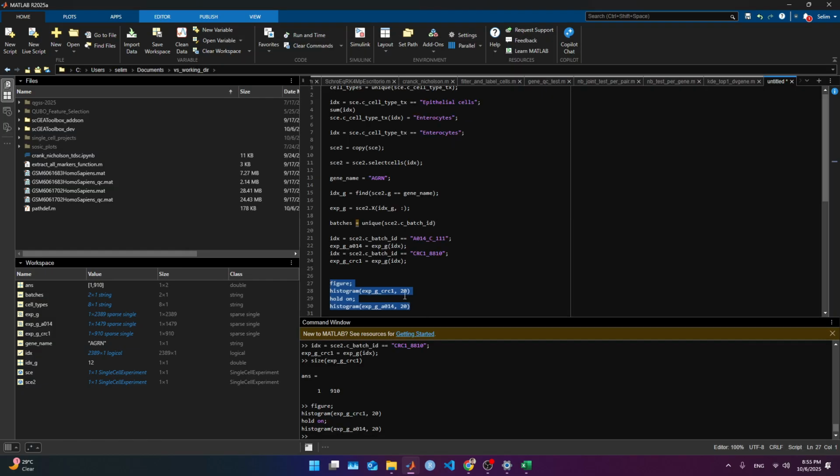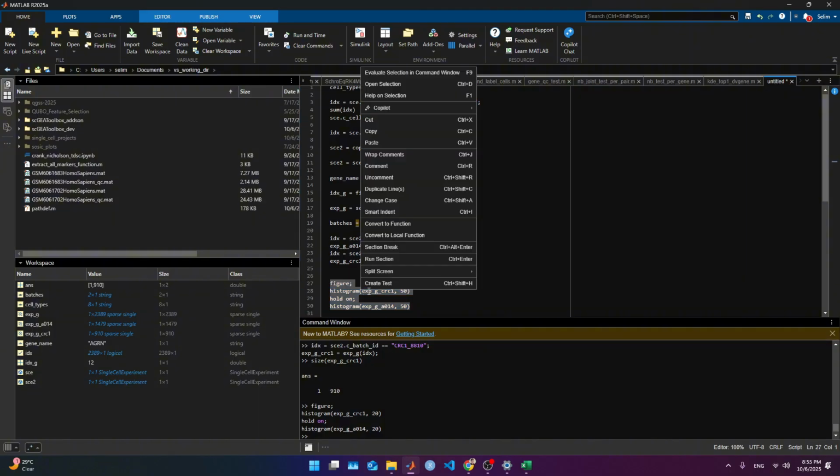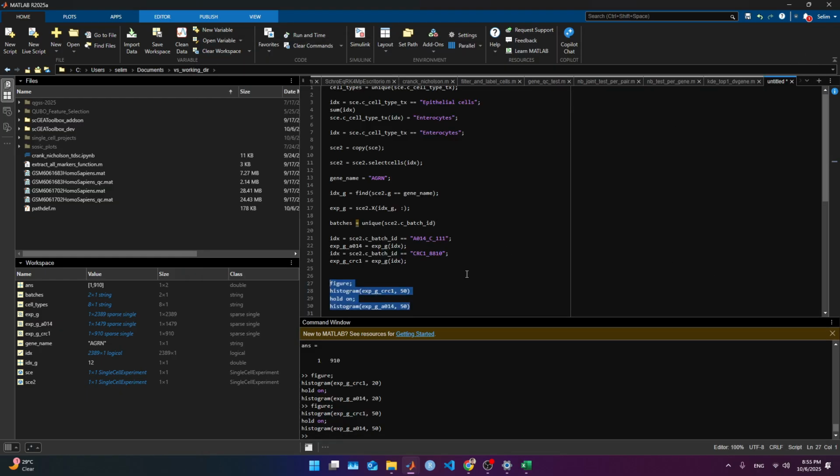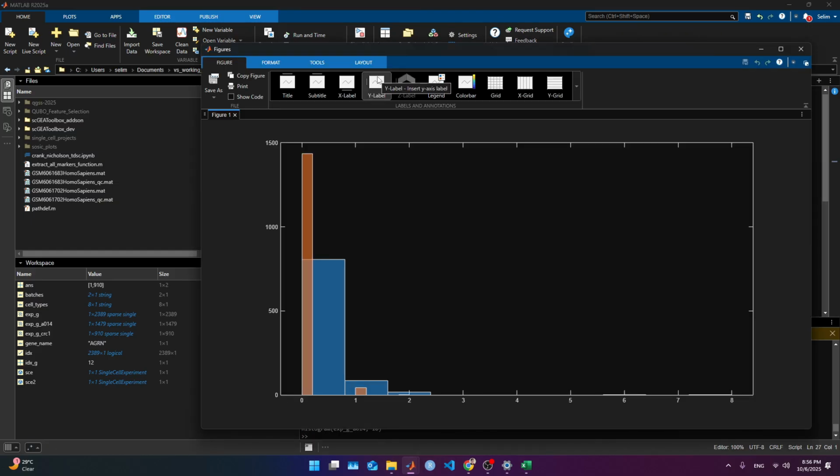Let's increase the number of bins to something like 50 and 50 and see how that changes. Okay, here we go. Okay, didn't change much. That means I can reduce to something like 10 bins. I'm going to use 10 and 10 and see if that helps me out or not. And that's it. We have that, the blue one. Which one is the blue?